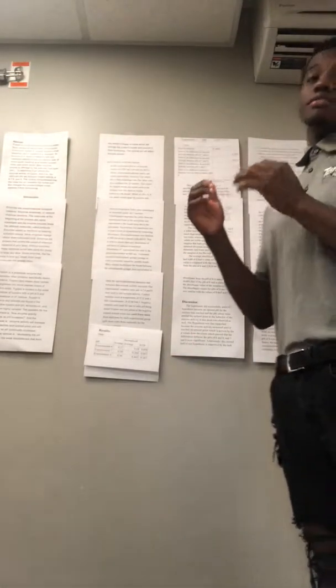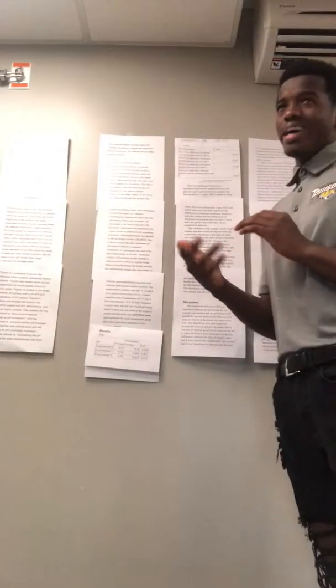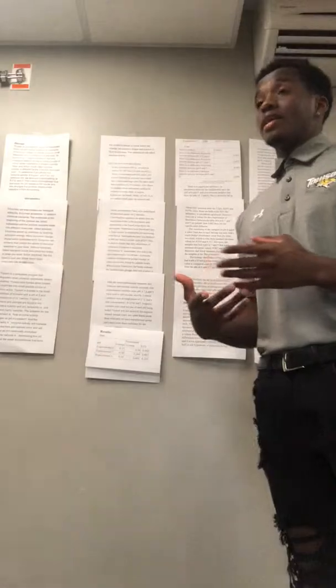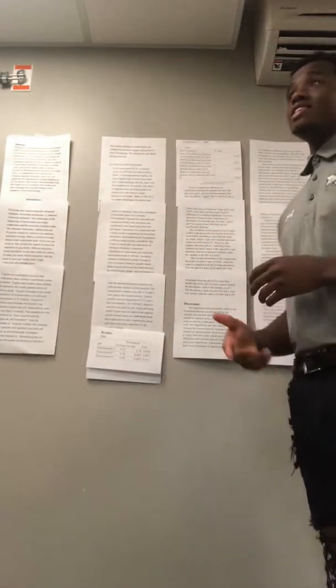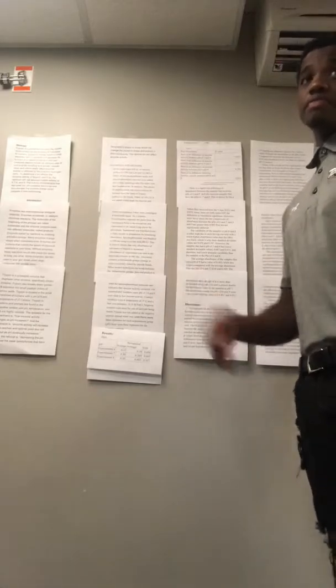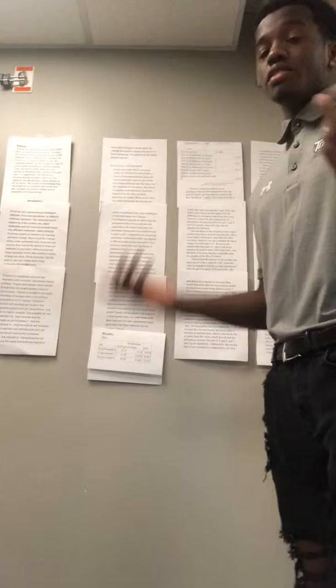But for pH 6 and 7, and 8 and 9, the values were larger. They had a higher number than 0.05, and they were not significantly different. Our hypothesis was supported because enzyme activity increased until it reached the optimal point, which was shown in the significant differences between 6 and 8 and 7 and 8.